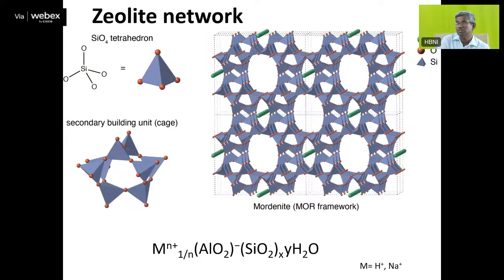So silicon MAS NMR is very well investigated, because there are a lot of compounds of silicon like glassy materials and zeolites. A very wide variety of compounds are available in the category of zeolites. Zeolite, essentially we all know, is nothing but an SiO4 tetrahedron, as I have shown here. See, it is a crystalline material, with tetrahedral coordination, and the bond angle, bond length, etc. are the same. All the 4 bond angles are the same. Similarly, all the 4 bond lengths are also the same. So there is symmetry. Due to this, we get a very sharp line in the NMR pattern.